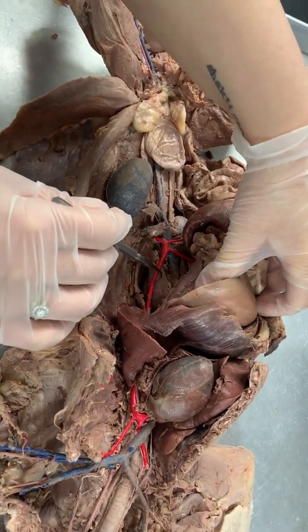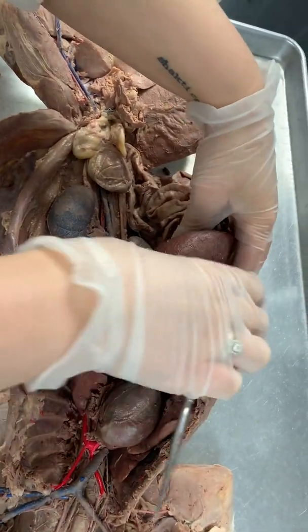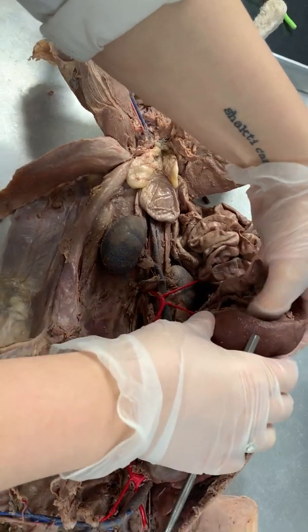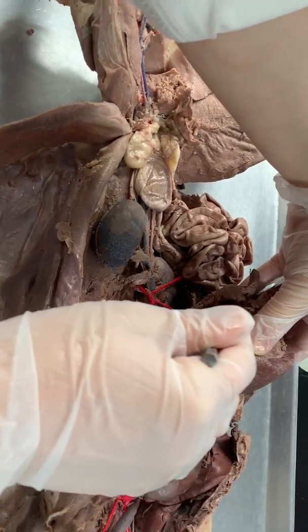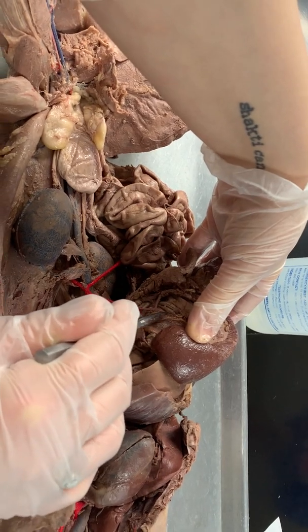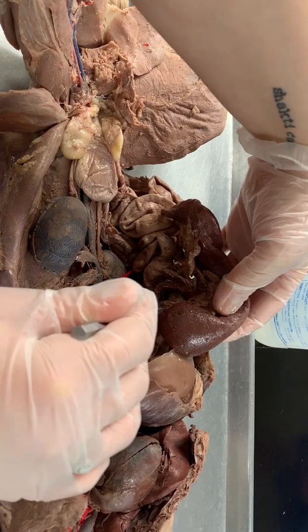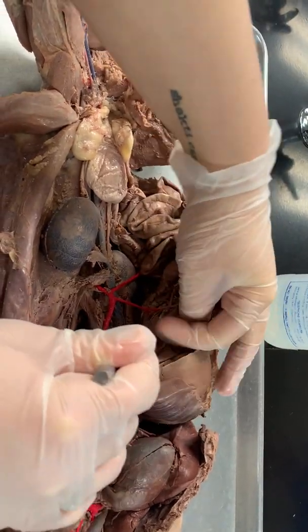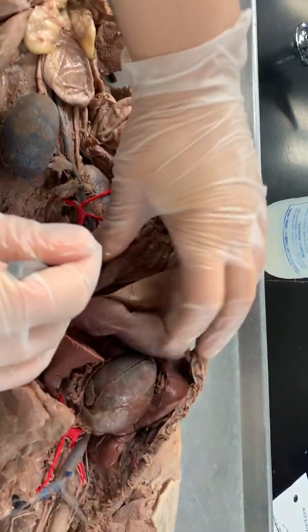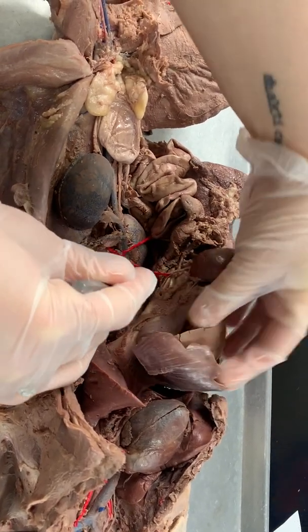So abdominal aorta, the first branch you have is the celiac trunk, and let's look at where those go. The most obvious branch is always going to be the splenic, which separates right here and goes to the spleen, which we can see. The next most obvious is the gastric, which is right here.